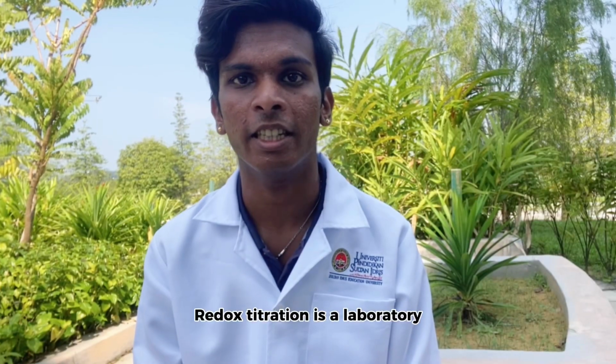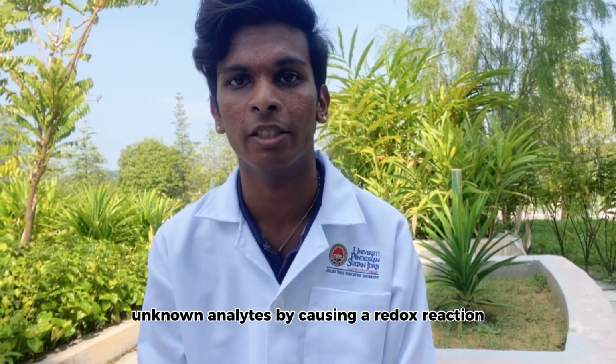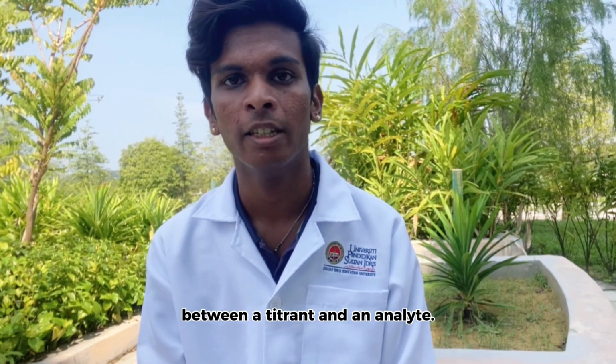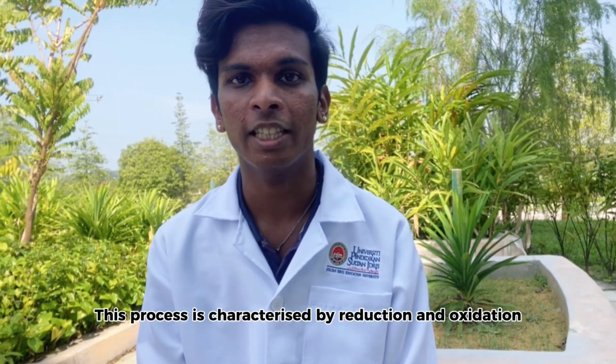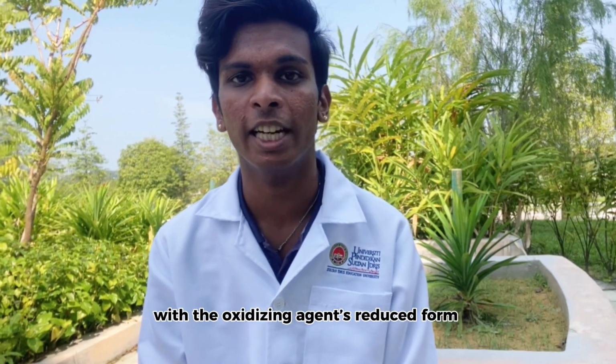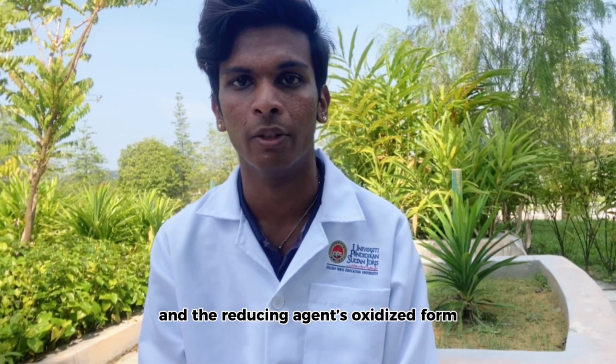Redox titration is a laboratory technique used to determine the concentration of unknown analytes by causing a redox reaction between a titrant and an analyte. This process is characterized by reduction and oxidation, with the oxidizing agent's reduced form and the reducing agent's oxidized form.